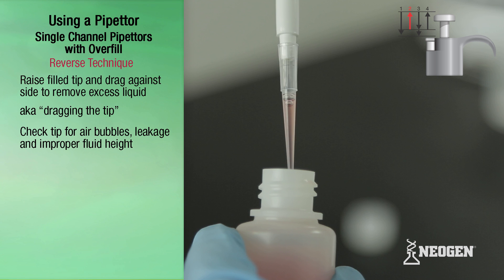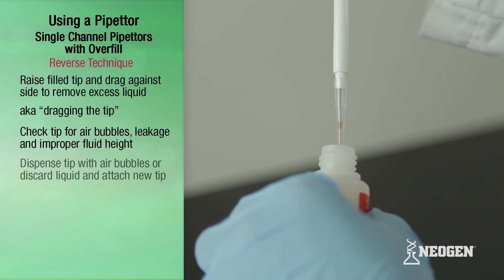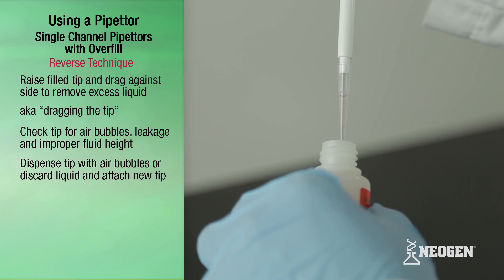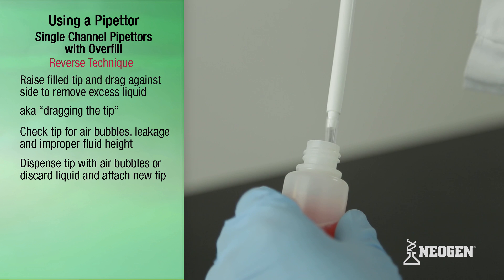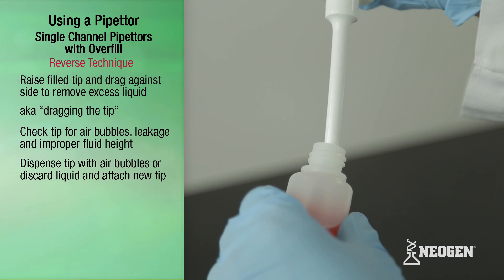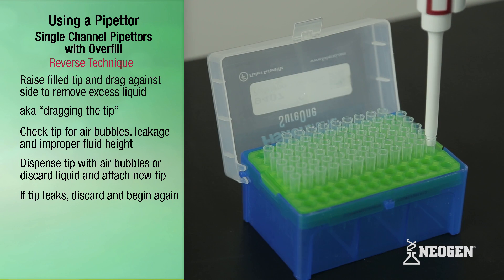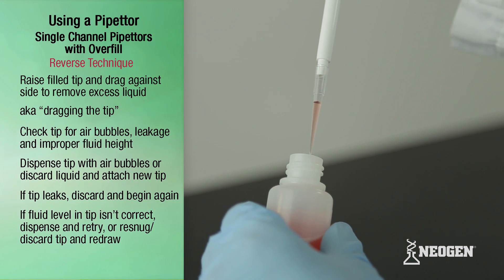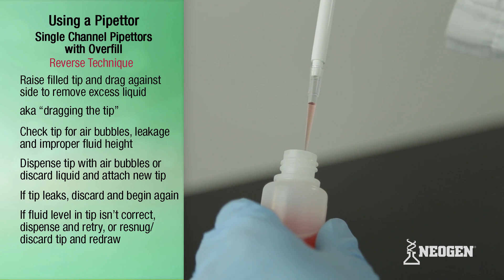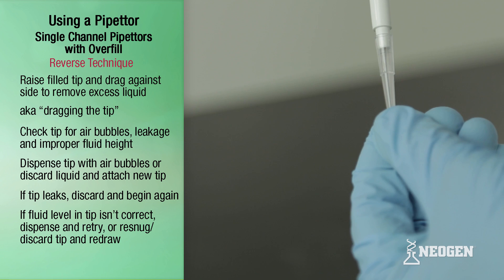Check the fluid in the tip for bubbles, leakage, and fluid height. If you see any bubbles, dispense and redraw the liquid following the procedure shown earlier, or discard the liquid and attach a new tip. If a tip is leaking, discard the tip, attach a new one, and begin again. If the liquid in the tip is not at the proper level, dispense the liquid back into the vessel, re-snug or discard the tip, attach a new one, and begin again.